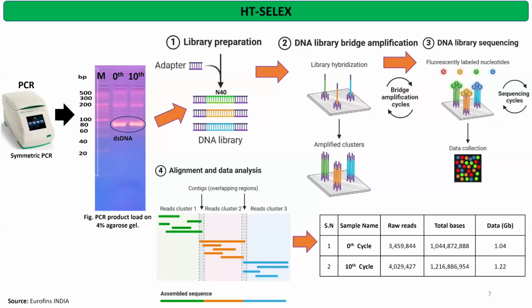Now, after performing the enrichment, we got the clue that we have aptamers where we got the enrichment. Now this is where HT-SELEX comes into the picture. For the HT-SELEX, we did the symmetric PCR, using the adapter to ligate, so that the machine can read the sequences. And this is the overall HT-SELEX procedure that we adopted.